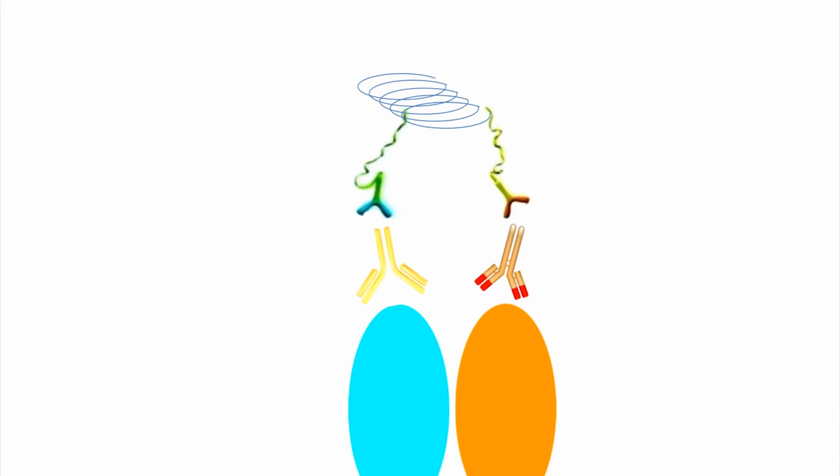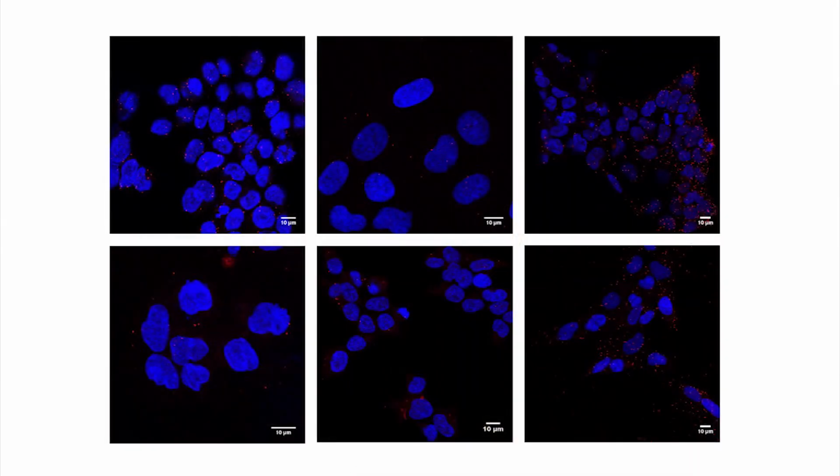two other circle-forming DNA oligonucleotides. Several hundred-fold replication of the DNA circle can occur after an amplification reaction, and a fluorescence signal is generated by labeled complementary oligonucleotide probes. Therefore, each detected signal is visualized as an individual fluorescent dot, which can be assigned to a specific subcellular location based on microscope images.